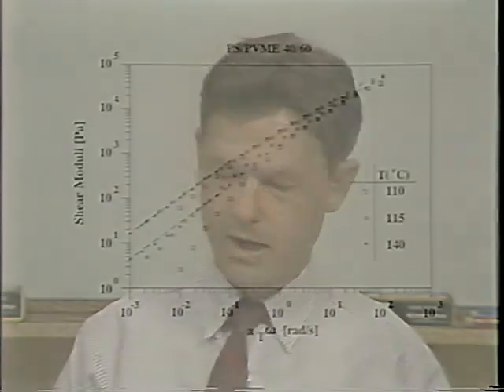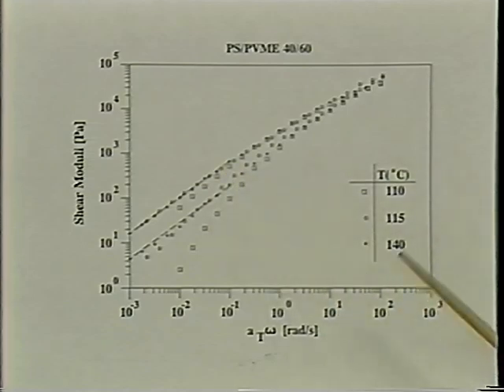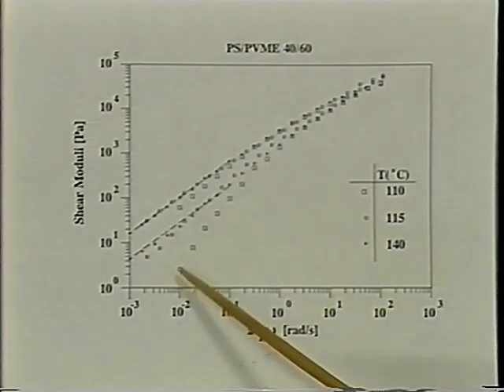But after having waited for those 100 minutes, we perform the rheological experiment, G prime, G double prime. Before that, there would be an extreme change of G prime, G double prime, and we couldn't associate a spectrum to a single morphology. And by doing that, you might remember the phase-separated system here has the power law coming in. That's what we discussed before with the gels when we talked about other systems with power laws. And this is the liquid behavior, which you saw before.